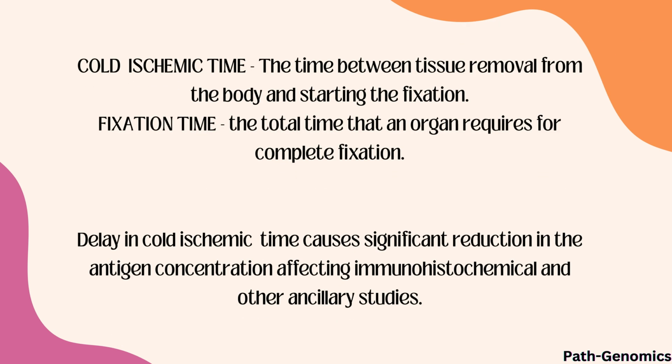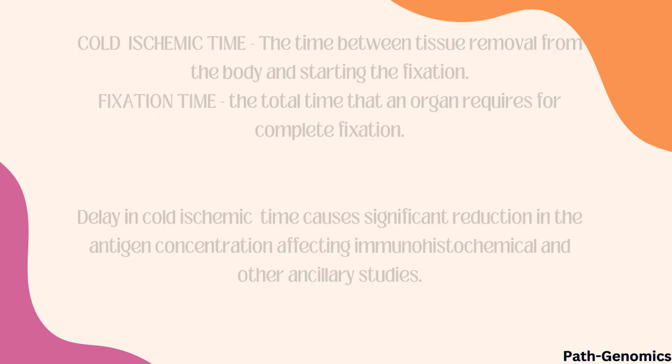Tissues with higher protein content generally require longer fixation times because fixatives need sufficient time to penetrate and cross-link with the proteins. This forms the concept of cold ischemic time, which is the time between tissue removal from the body and time of starting the fixation. Delay in cold ischemic time causes significant reduction in the antigen concentration, affecting ancillary studies, while fixation time is the total time that an organ requires for complete fixation.